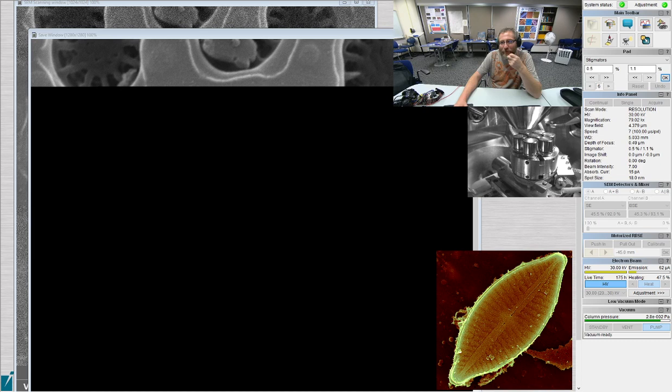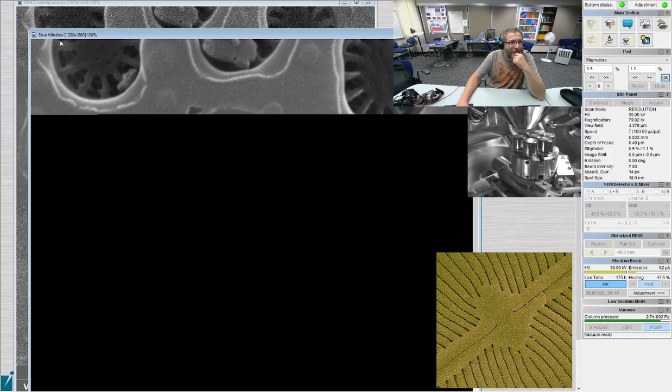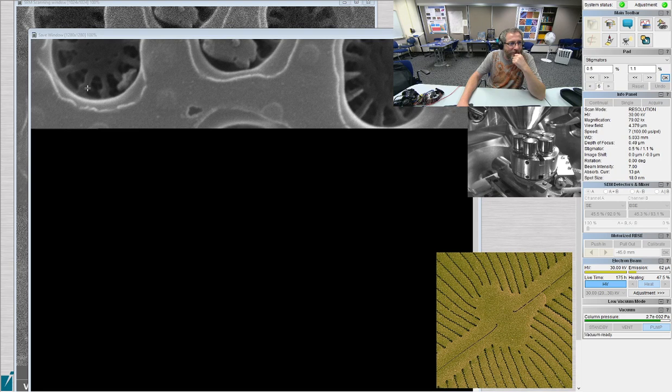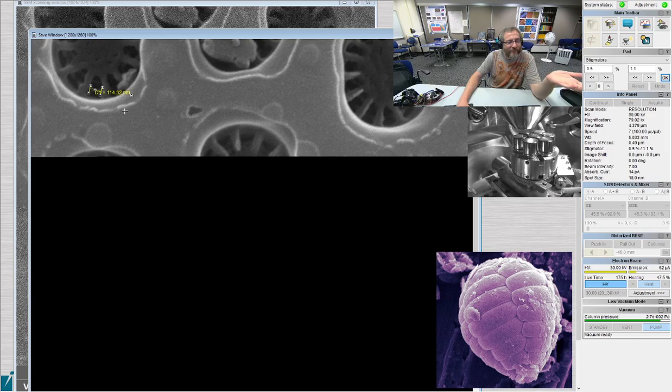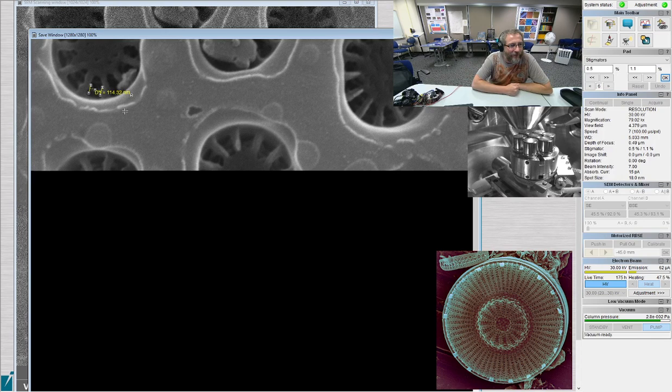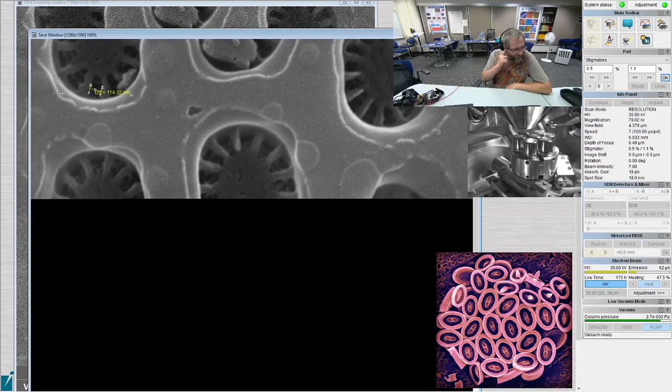How wide are the crossbars? They look very small. They are extremely small. Let me measure them. As long as we're doing measurements, why the heck not? These little guys? I wouldn't worry about these little guys. 100 nanometers. That's the size everybody wants me to look at, you know, can I look at bacteria or viruses or something? This is the size range those are in. That's what they would look like, little kind of blobs. They're not very big. So, sort of in the size range of a coronavirus right there.